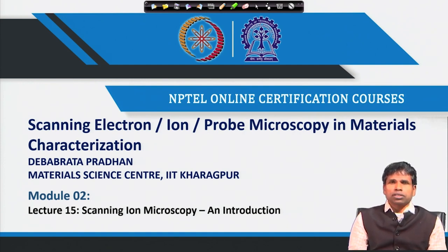From today onwards, in the next few lectures, we will be focusing on scanning ion microscopy. Instead of electrons, we shall see how the ions interact with the specimen and produce signals, and how those signals can be utilized to produce surface topography or surface morphology.